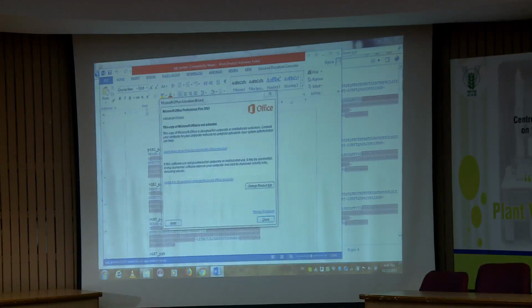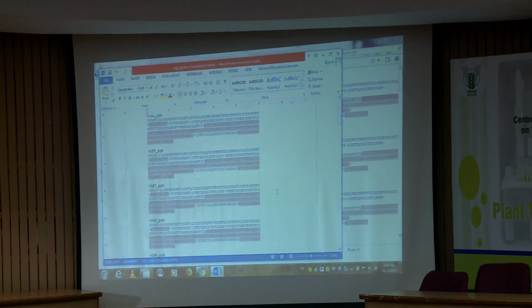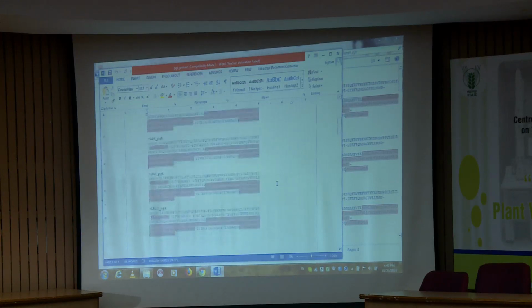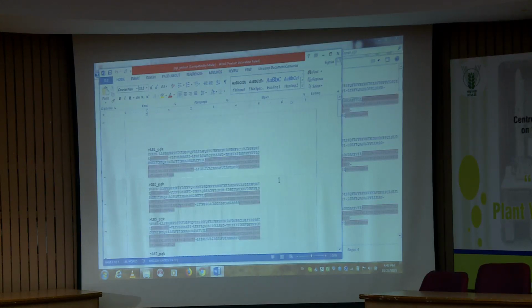Likewise, like I had shown you that nucleotide file, in a similar way prepare this protein file for each sample, sample number 1, 2, 3, 4, 5, with the primer name I had kept, and everything pasted here, right. Some editing is also required over there.